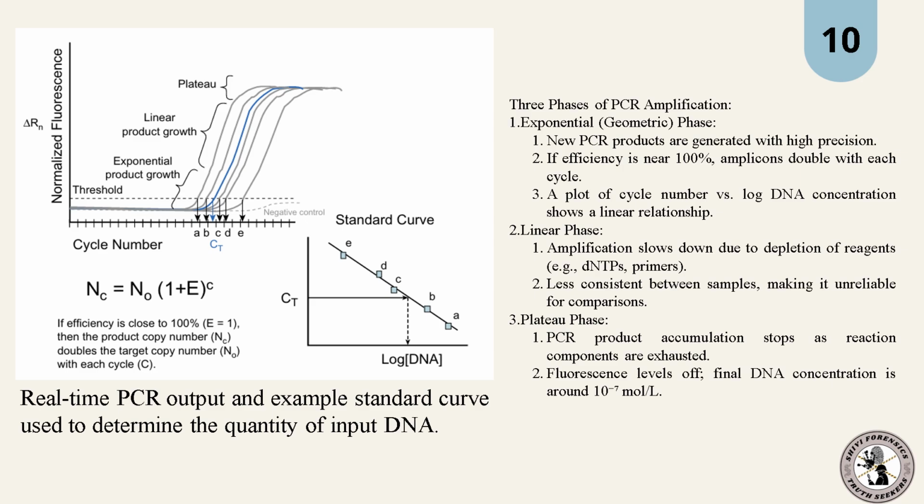The next phase is the linear phase. Now in this phase, what happens? The amplification is happening, but the PCR reagents are being depleted.